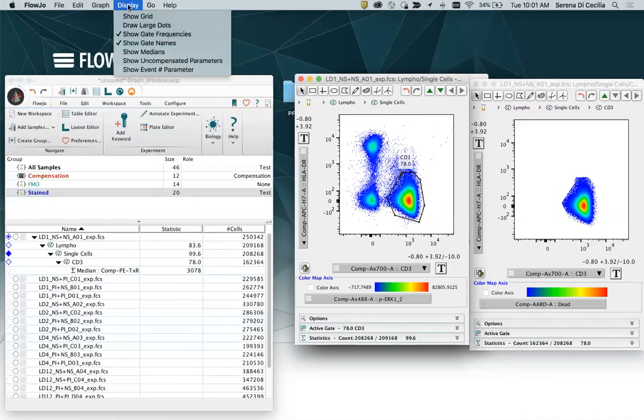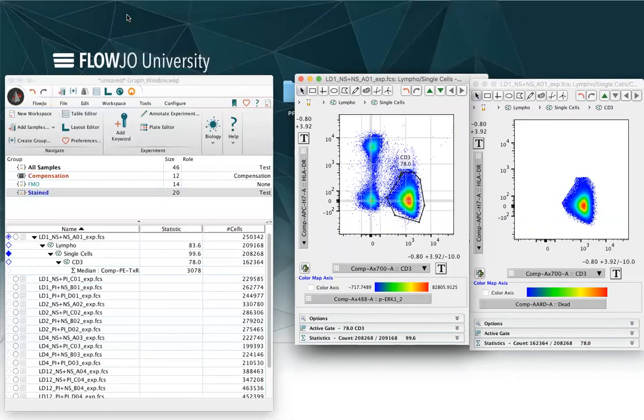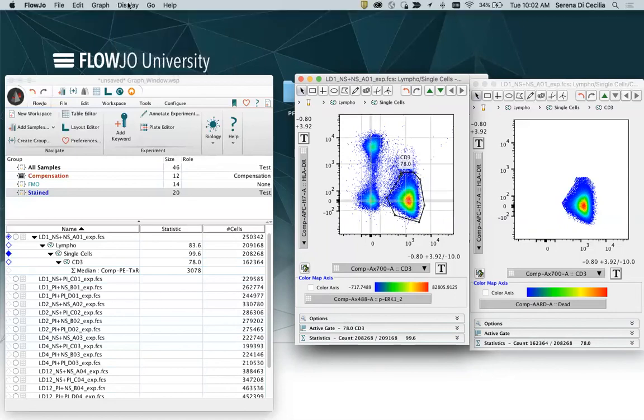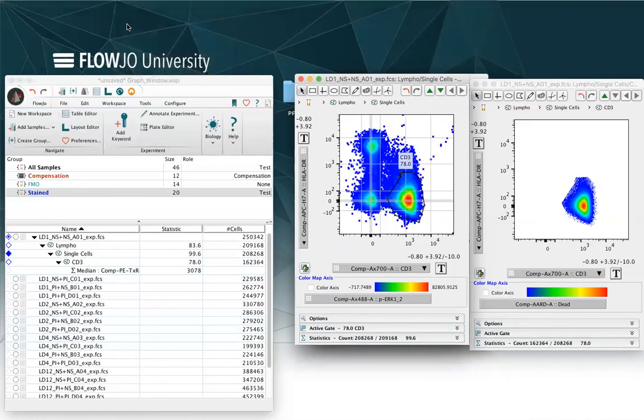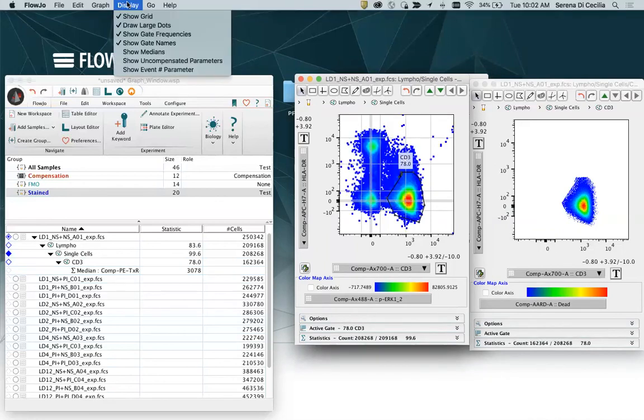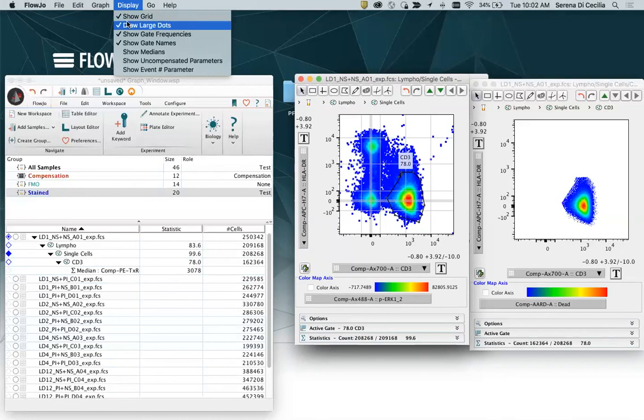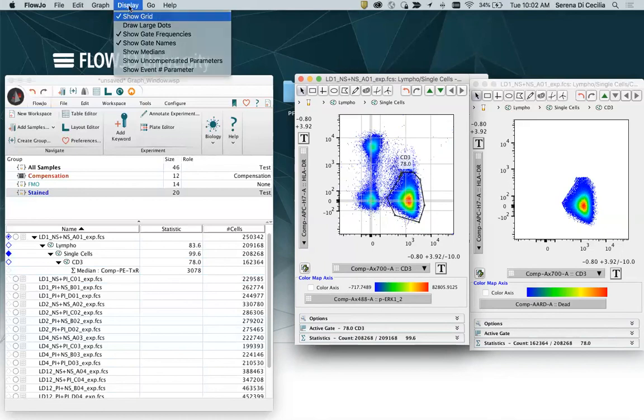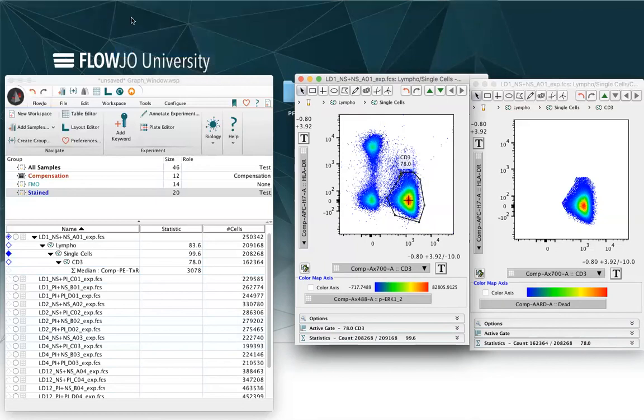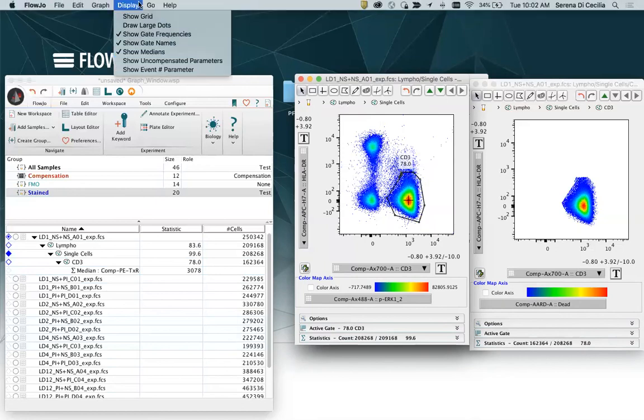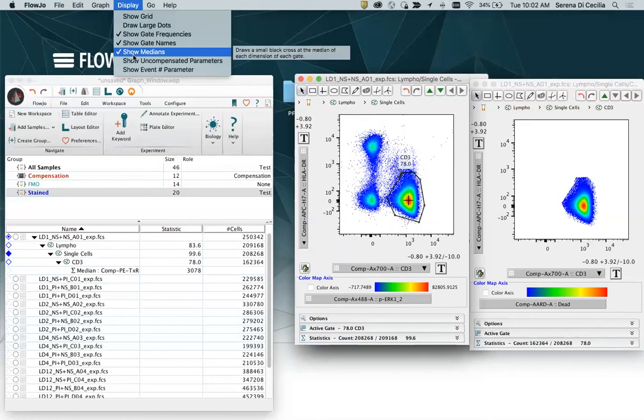And in display, you can select what's inside the plot as, for example, showing a grid or drawing large dots. You can also ask the software to show median or uncompensated parameters if you have different parameters or the event number parameter.